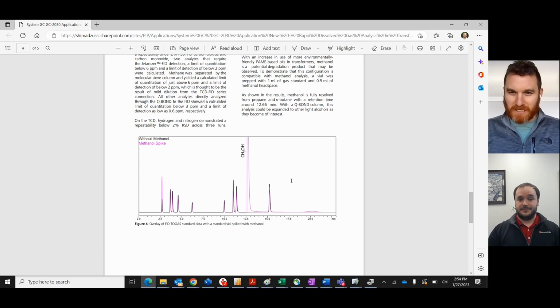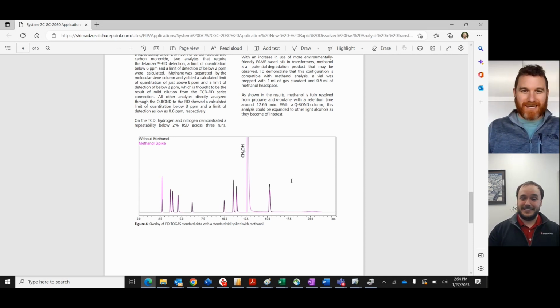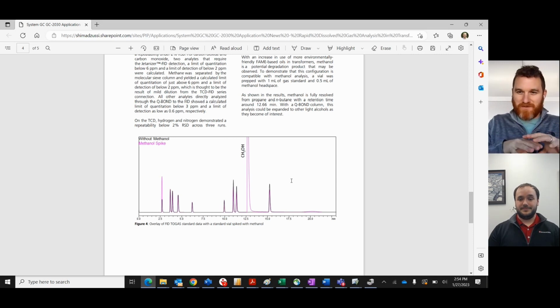I wonder if that's dimethyl ether coming out at 20 minutes, that can react pretty quick. It's an excellent point. Yeah, so these are those sustainable, renewable oils. I've seen those, and we've been on some ASTM committees where there are methanizer failures because of these, I think they call them FR3s or FAME-based oils. I've literally been to labs where you pull a drawer open and it's full of old nickel catalyst methanizers that have died. Some of them die within a day of running these oils.